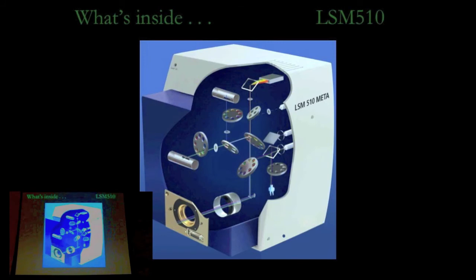What you have to control, there are several controls that will affect the intensity of the light. Obviously the power of the laser, how much laser power you allow to come through to the sample, and how fast you scan the mirrors. You can adjust the speed of the mirror, and depending on how long you dwell at each pixel, if you slow the mirror down, you'll have more time to sample at each pixel, and if you speed it up, less time, so less light.